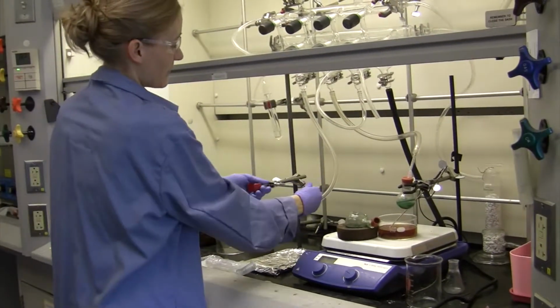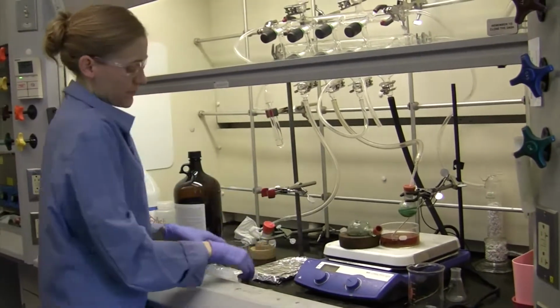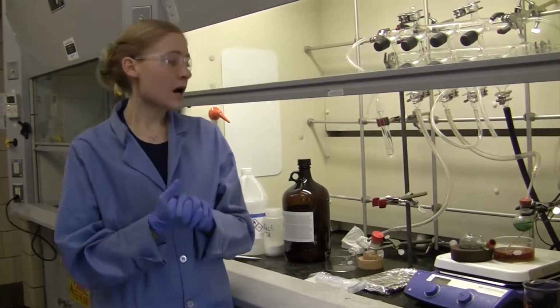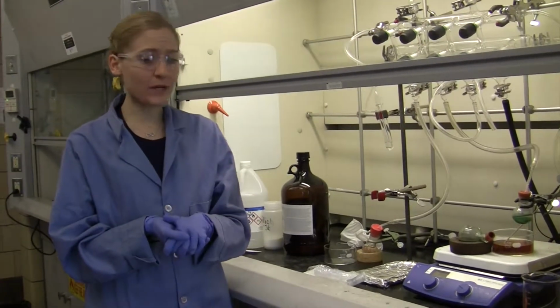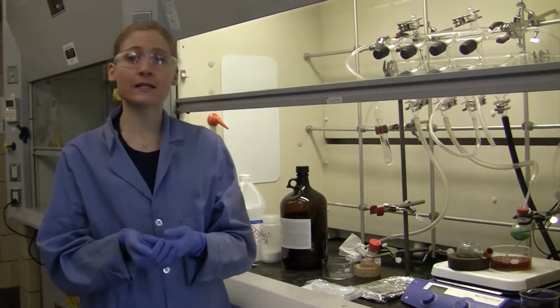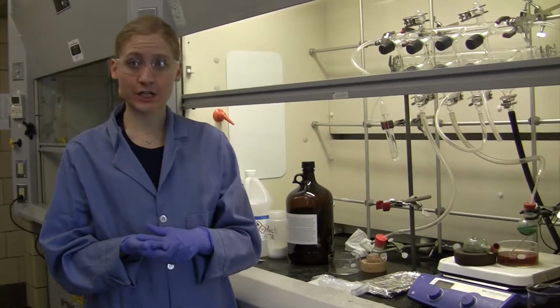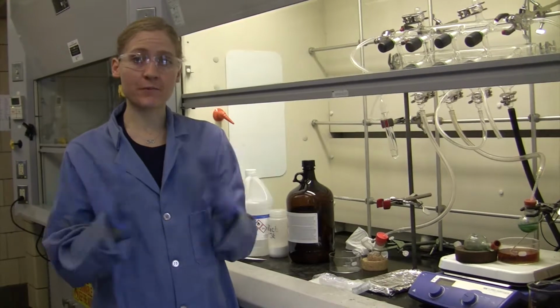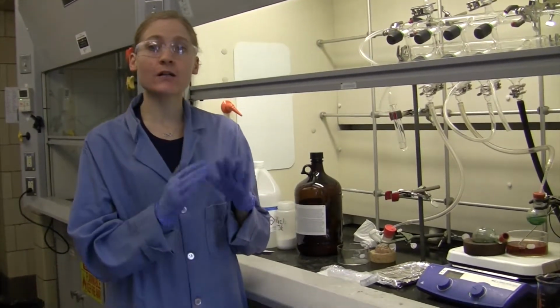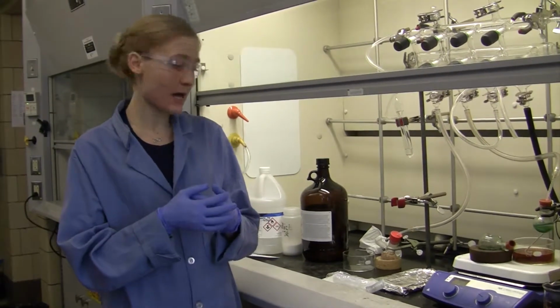This is the set of column that we'll be using in this class. Organic chemists tend to use a really long column. In polymer chemistry, we tend to use plugs, which are a little bit shorter. Basically, the difference is in a column, you collect fractions and separate fractions of a product, whereas in a plug, you pour all of your material through and collect everything that comes out the other side.